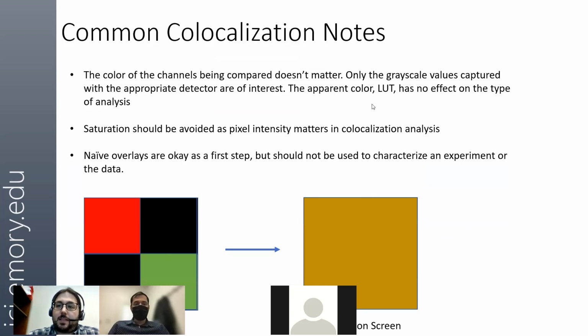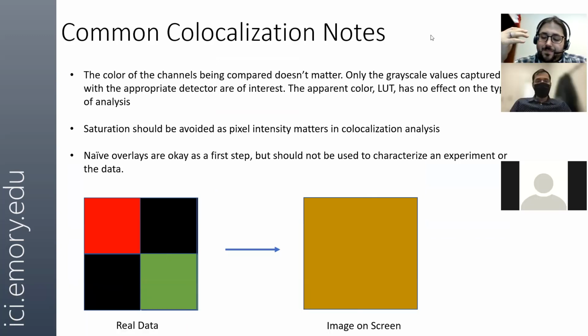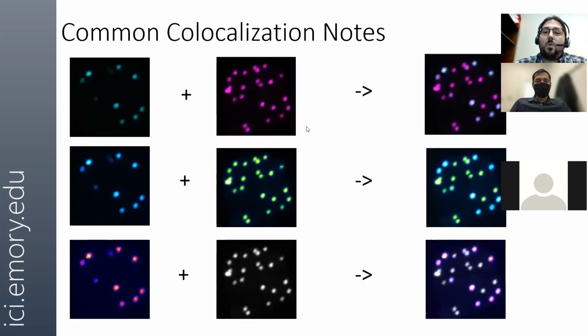And that is not, in fact, the only consideration. The intensities for the different pixels and how those images are then shown on a computer screen, for example, can have an effect on the apparent colors. So what we've seen before is what those images look like to us by eye on a computer screen. That doesn't necessarily mean we know what the data itself looks like.